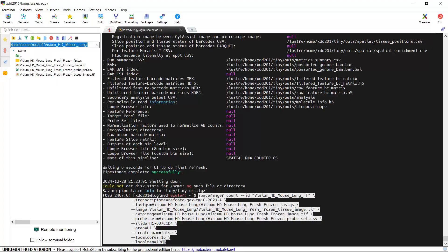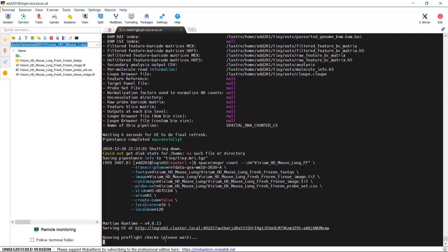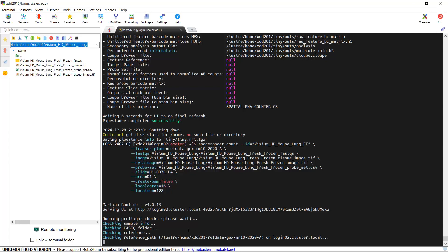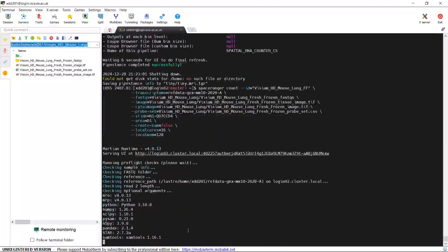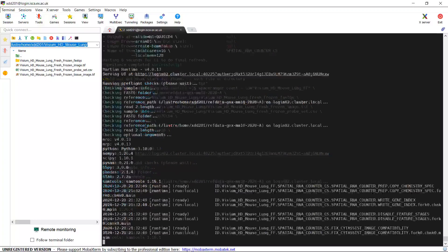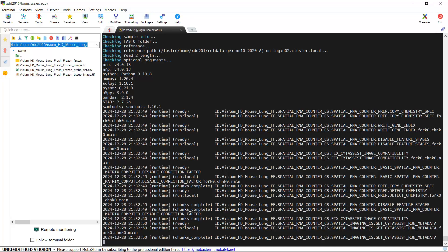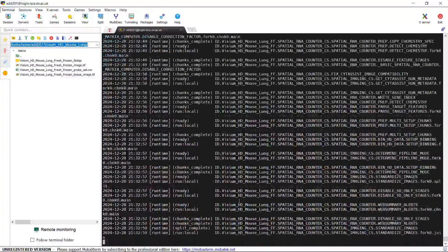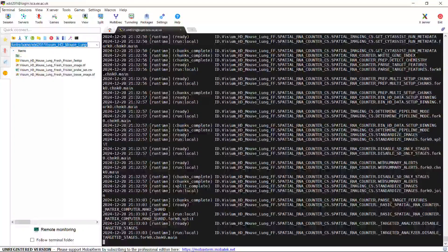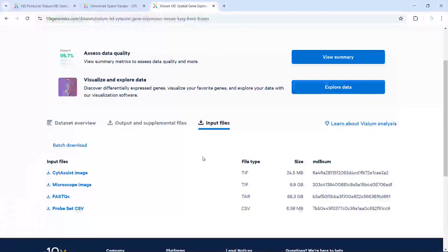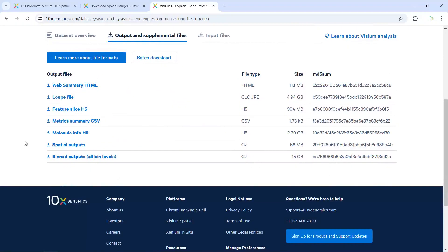Now we can run the code to analyze the Visium HD mouse dataset. You can see it is running — it will take quite a while to finish the analysis. After the analysis, we should have an output folder. We can have a look at the expected output on the 10x Genomics website. Here are the input files for Space Ranger, and after the analysis we should have the output and supplemental files with the output files listed here.